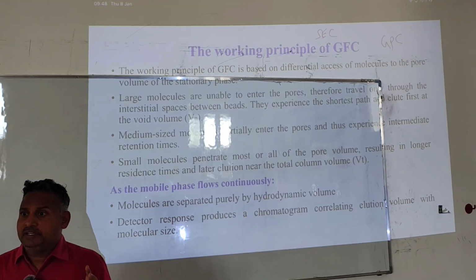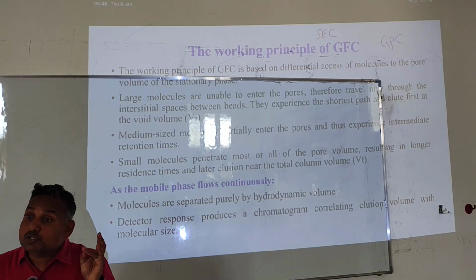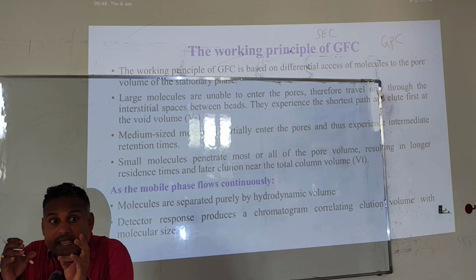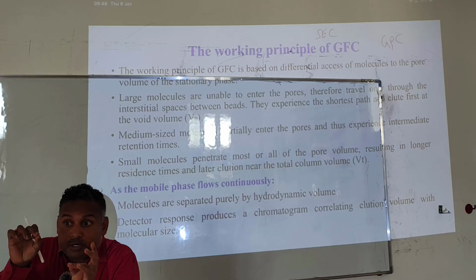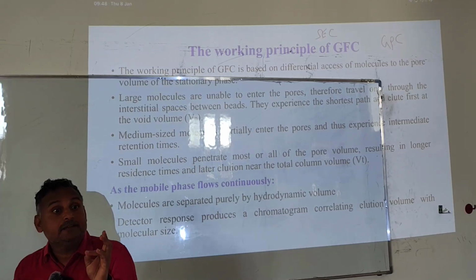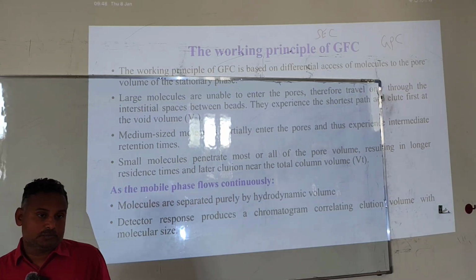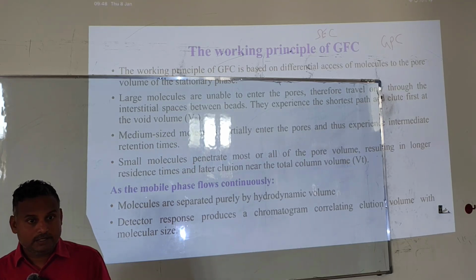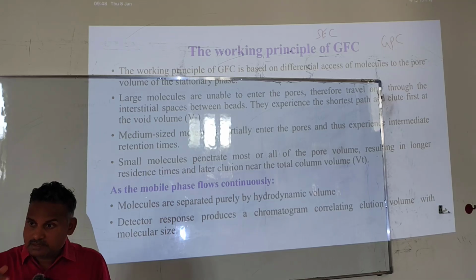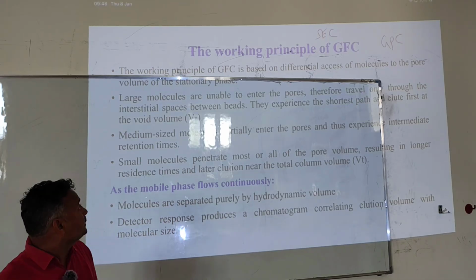Gel permeation chromatography. Size exclusion chromatography. That means the molecules are excluded from entering inside the porous particle based on the size. That's why size exclusion chromatography, and also gel filtration chromatography. Names are different, but the technique is the same. One name is based on the mechanism, another name is based on the stationary phase, and another one is based on the mobile phase.